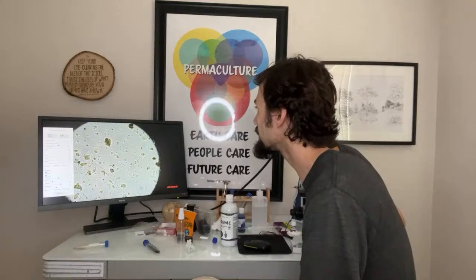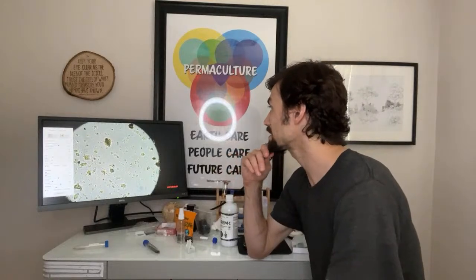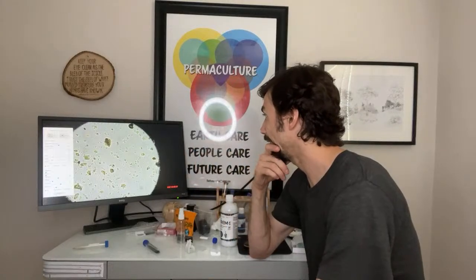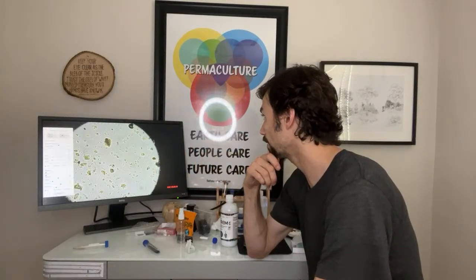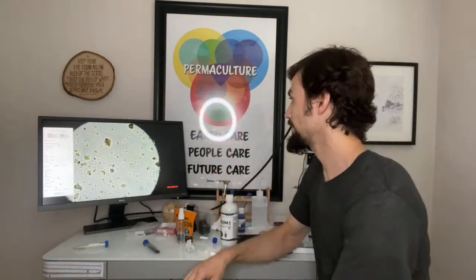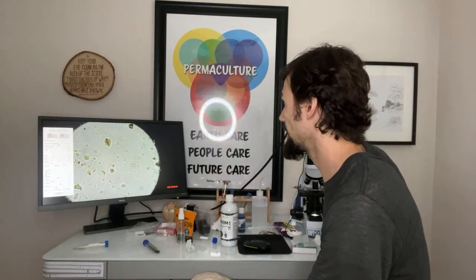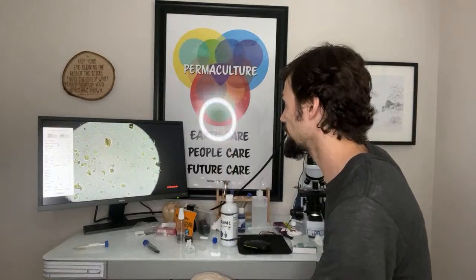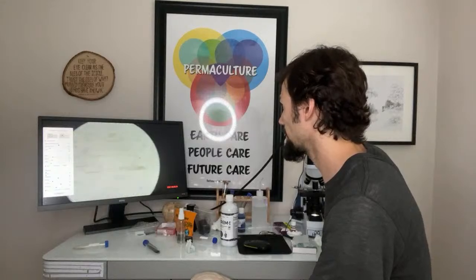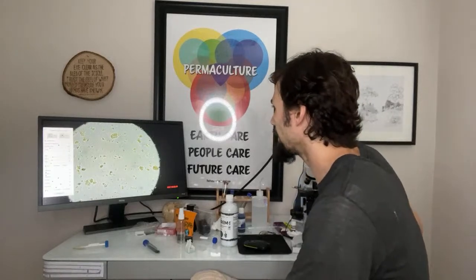And it's not as numerous with the rhizobacteria, nowhere near as numerous as the azospirillium or recharge, but they are there and they're active. They're moving around a lot and they're conjugating a lot. You can see them going crazy. And let's look for some spores. That looks like a spore right there. But there's not that many.